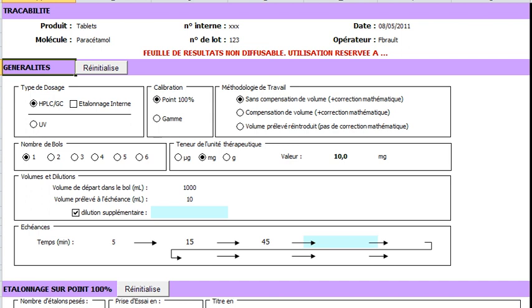You will see that this is very easy to fill the form because of the numerous checkboxes and option buttons. First of all, we have to fill the form with general information concerning the method.